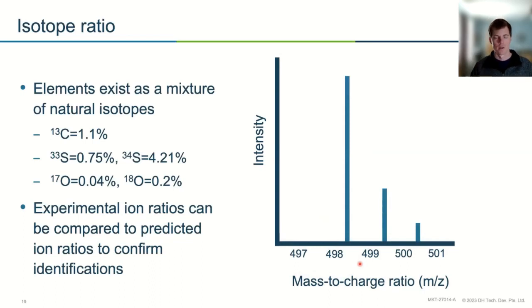If you remember back to Chem 101, when you calculate a chemical formula, it's never just carbon 12 plus oxygen 16, so it's exactly 28. There are always some decimal points there. The reason is that almost all of the elements in the periodic table have natural isotopes that exist in nature. So carbon, which we know is 12.0000 AMUs, 1.1% of a natural mix of carbon is actually composed of carbon-13.